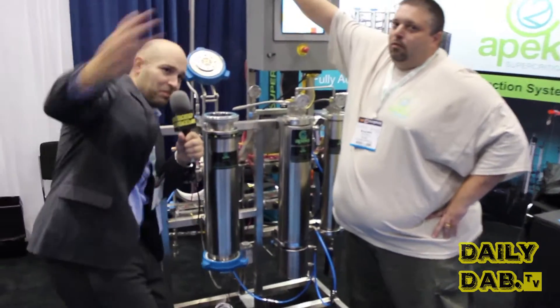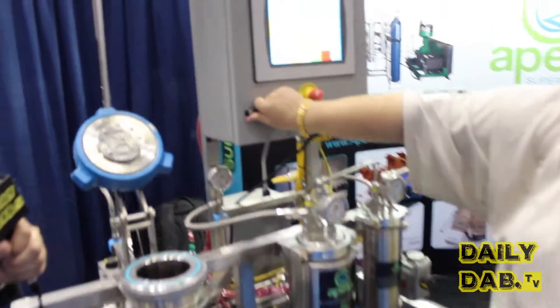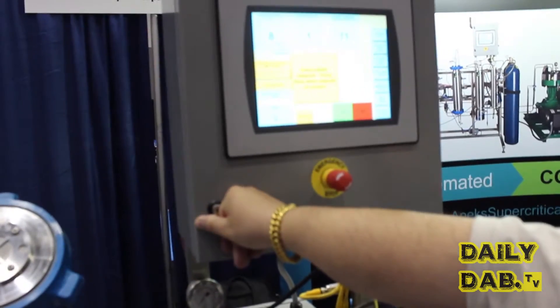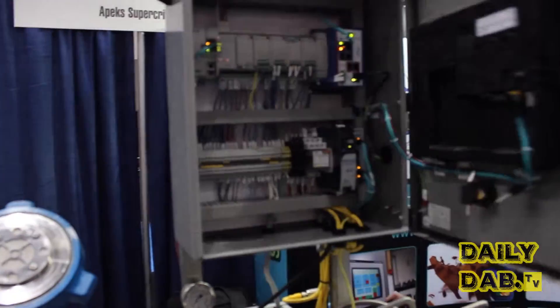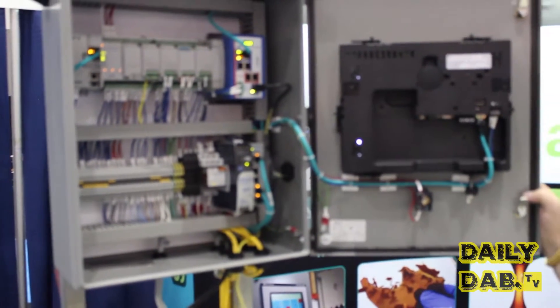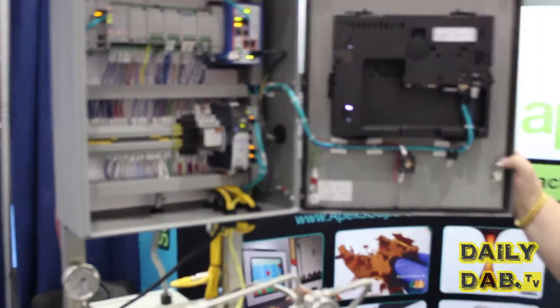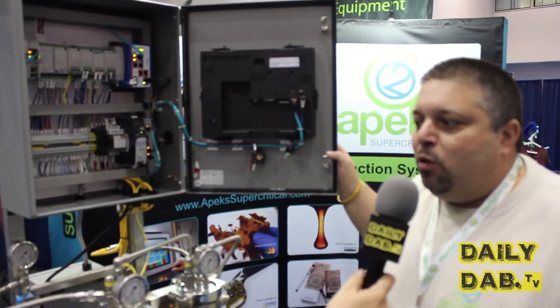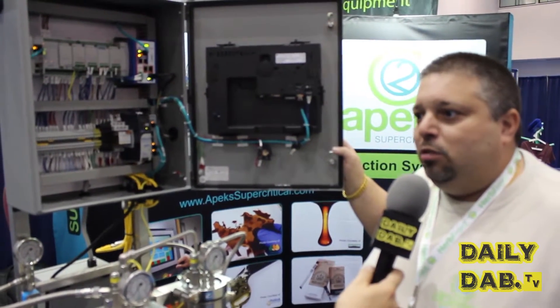Come over here. What we have here is the control panel, where we set the parameters — Allen Bradley control panel, PLC. That's where the brain is. That is one hell of a brain. It is WiFi and internet capable, meaning you can literally turn the machine on, turn the lights out, go away. And if something happens — such as a CO2 tank getting low or it going into recapture mode — whatever parameters you want set, you'll get a text message or email alert.